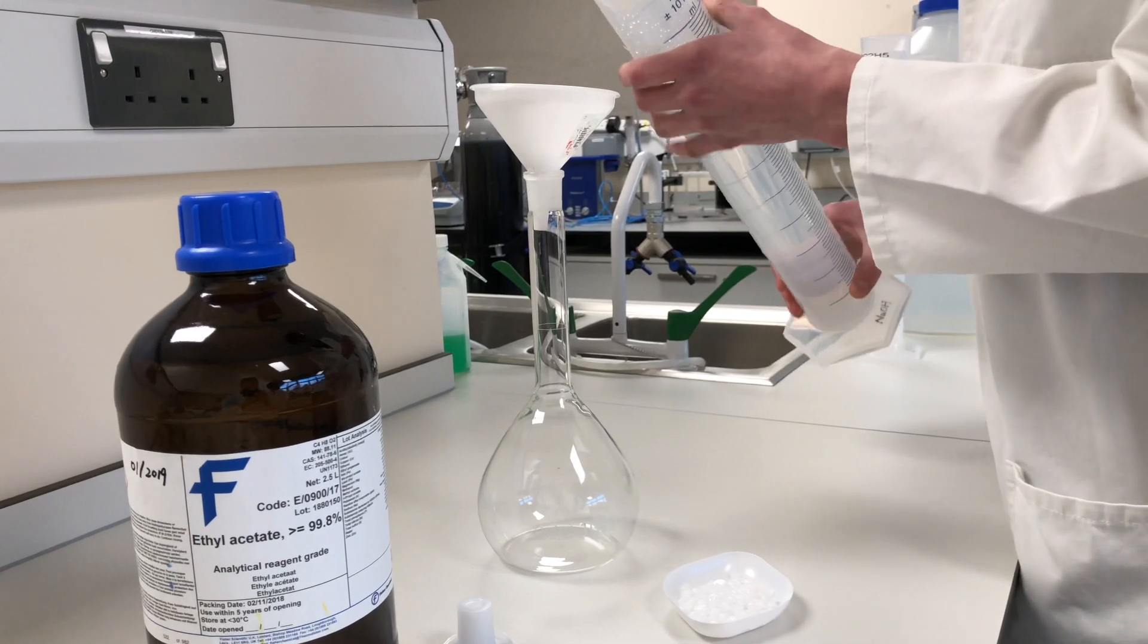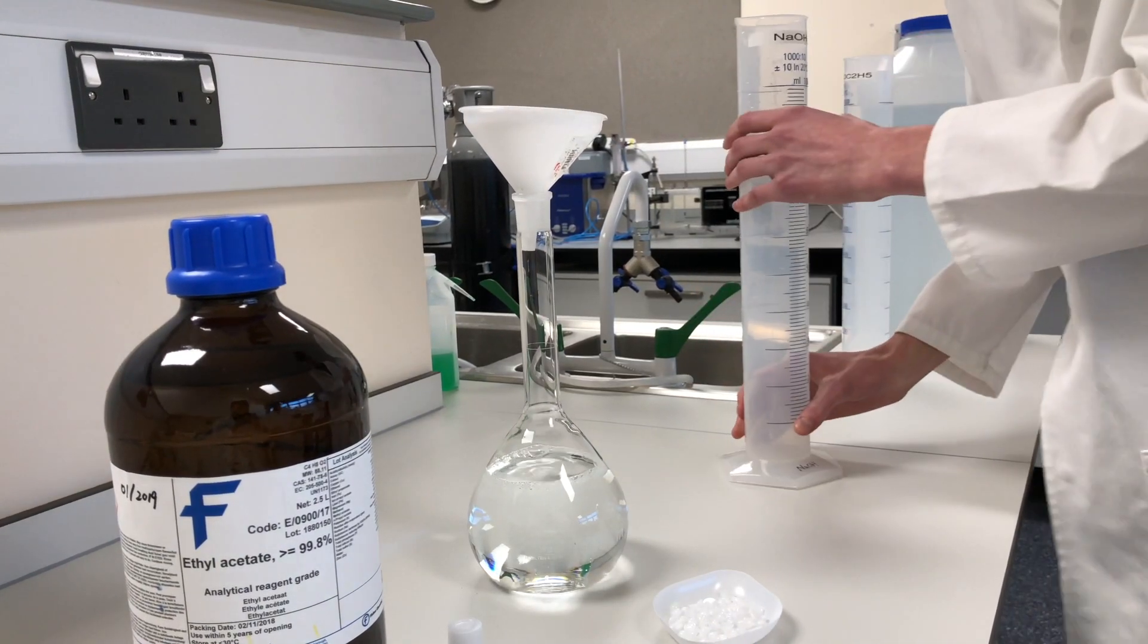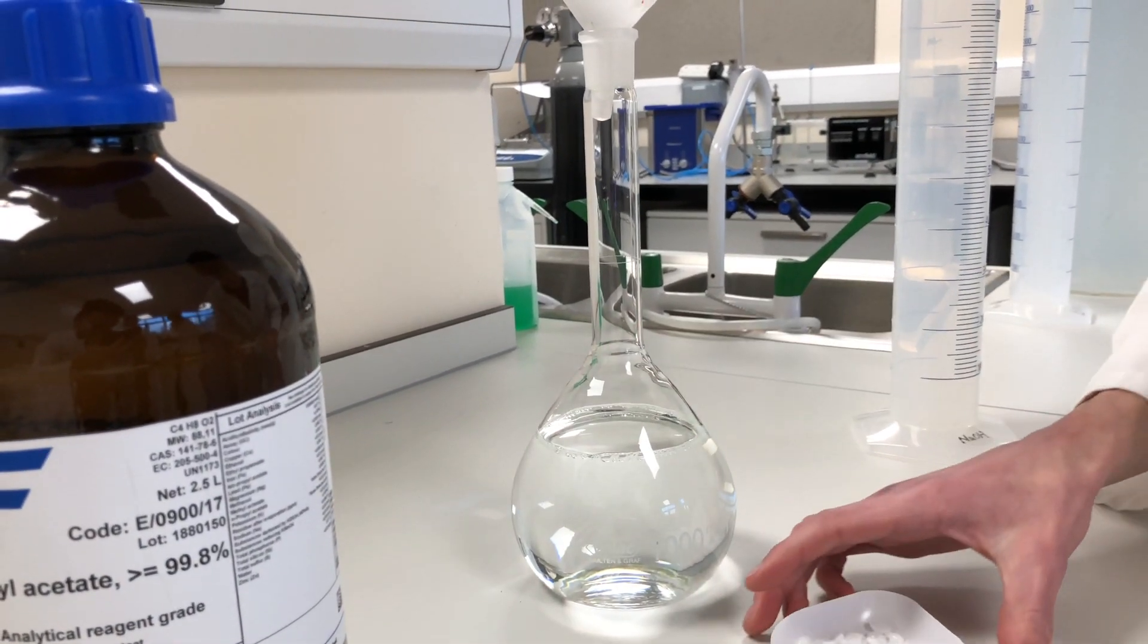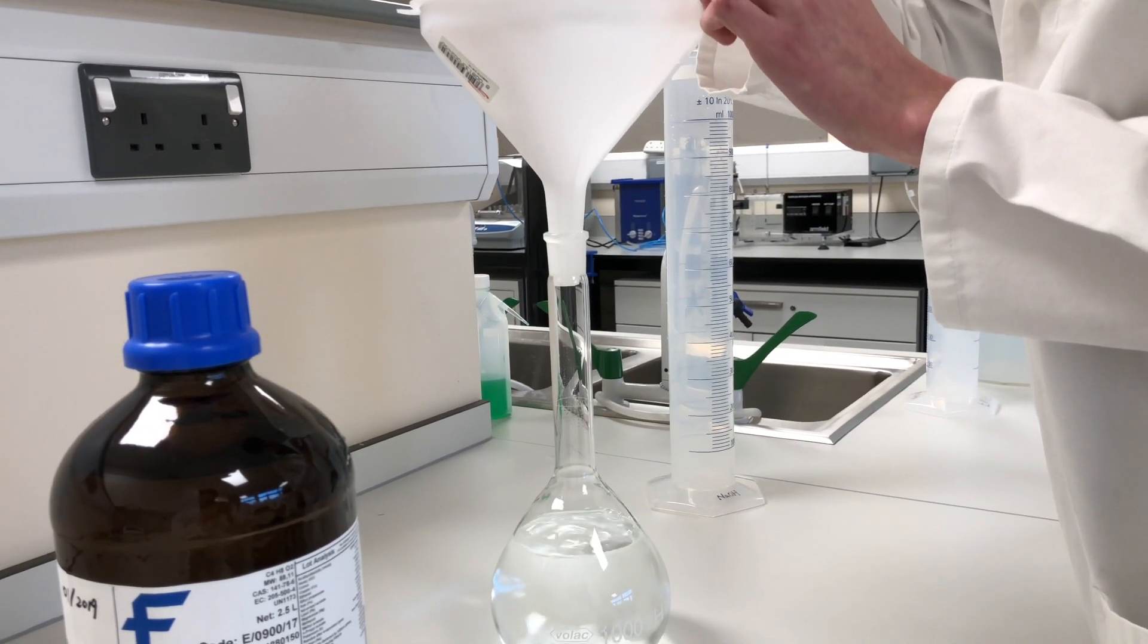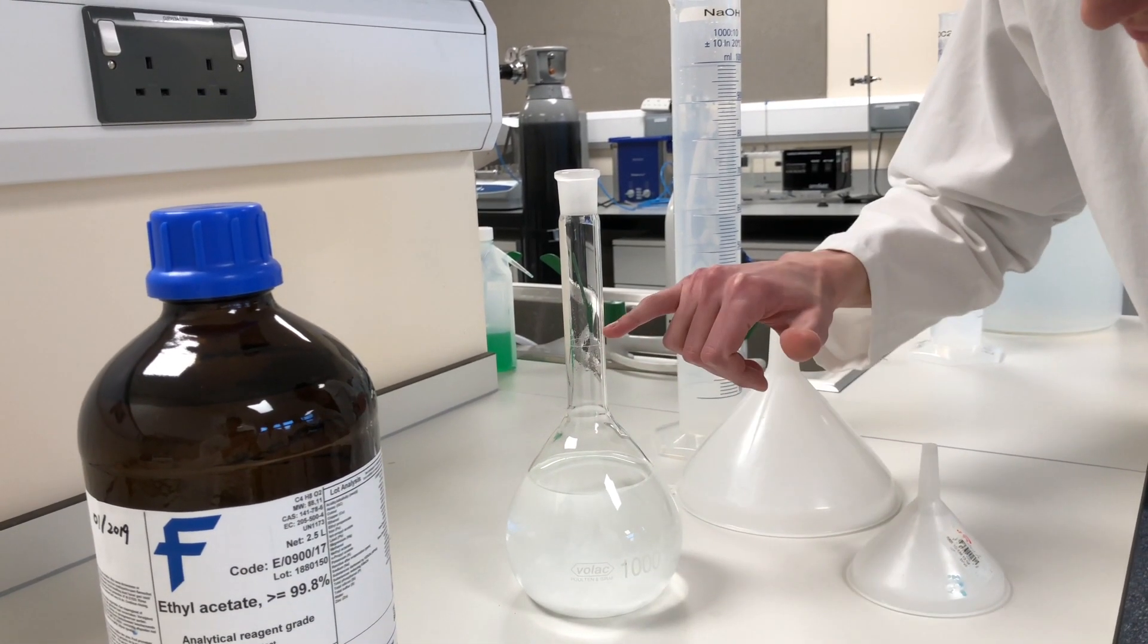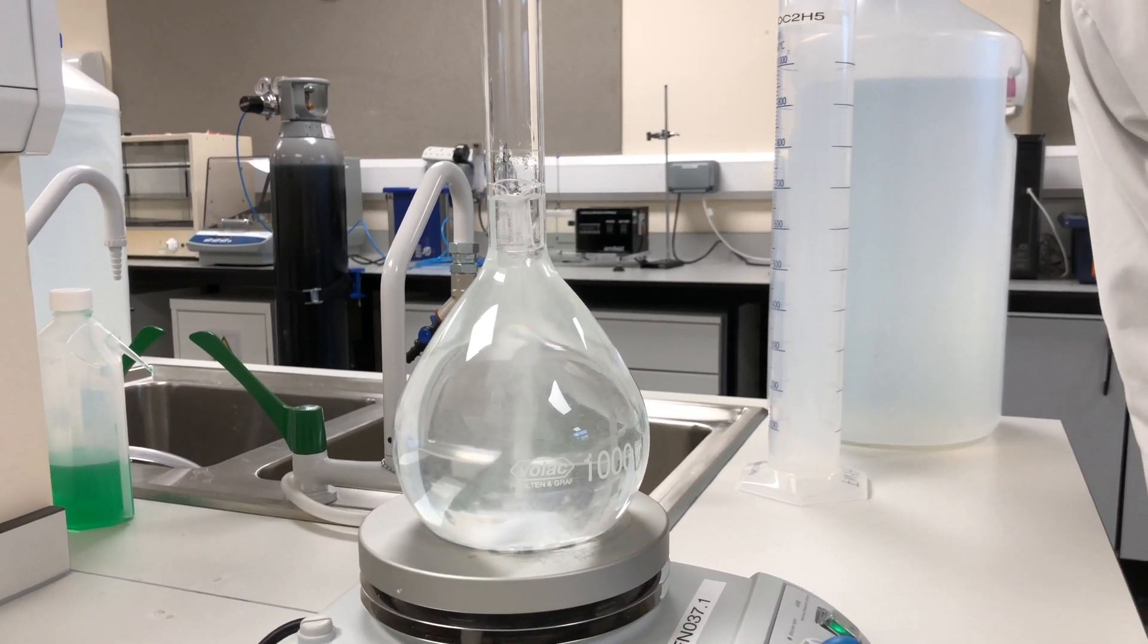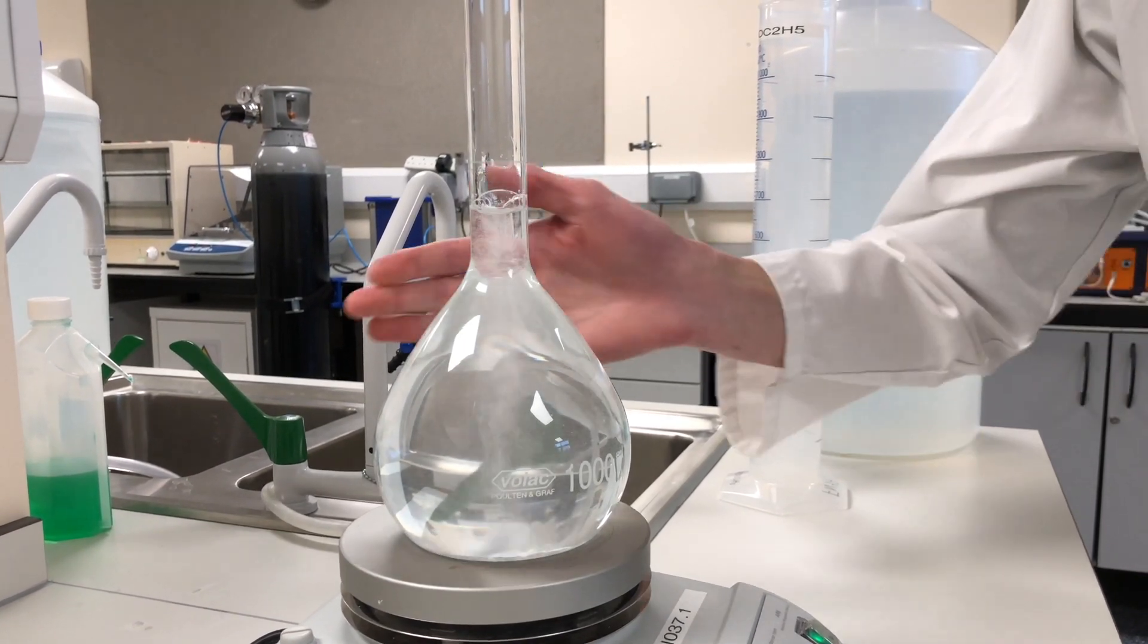We'll take this away and we will make the solution. So we have our flask here, and we're just adding some distilled water to it. You can see here that we've just fallen slightly short of the marking, because if we go above this, then we don't know the exact concentration. So we're just adding the sodium hydroxide pellets. Make sure we've got them all. The sodium hydroxide pellets have started to dissolve.